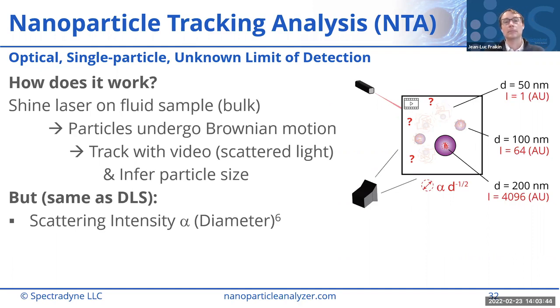Because if the pre-filter does not filter out those larger particles, if they're going in long ways, I would assume that if we're using a cartridge size that is smaller than that length, then that data would not show up, right? So it essentially might look like it didn't get picked up at all. Is the best way around that using multiple cartridges to filter out what we can, or would it just be very biased?